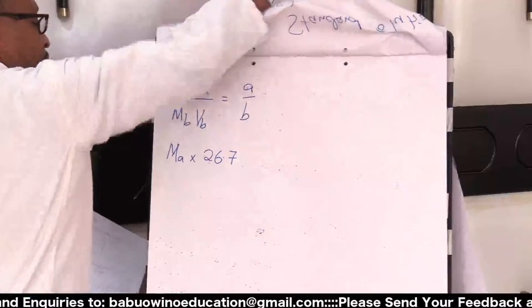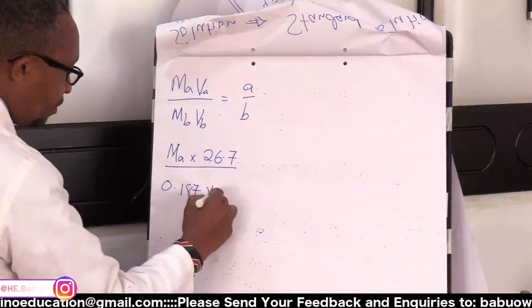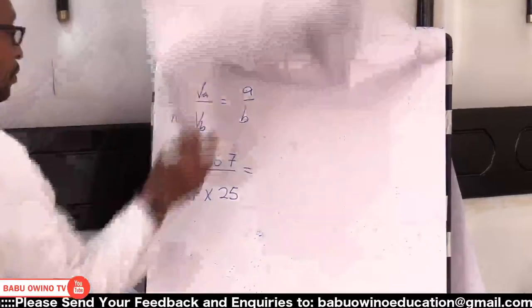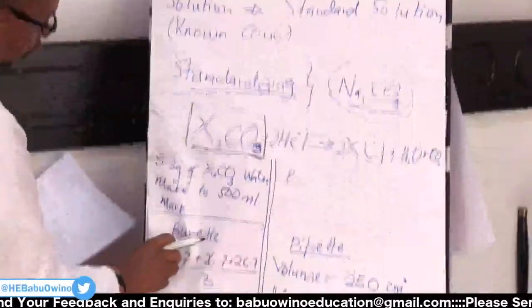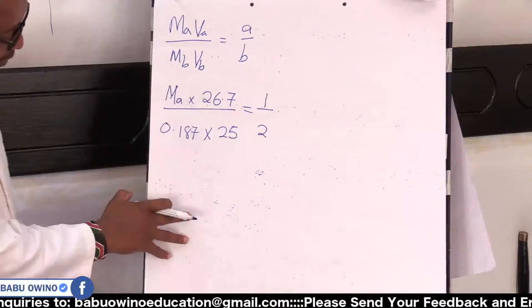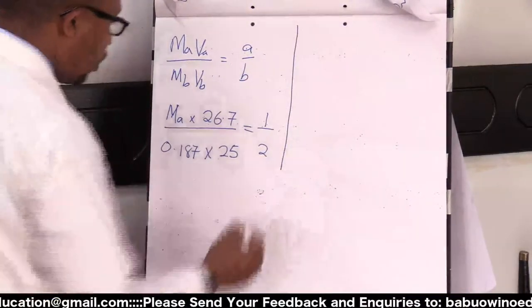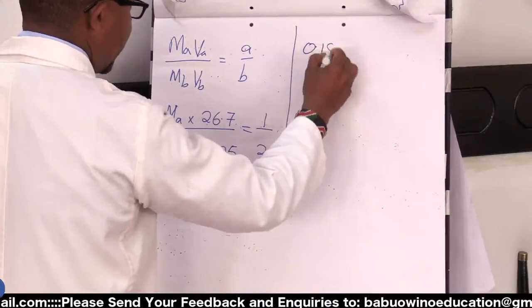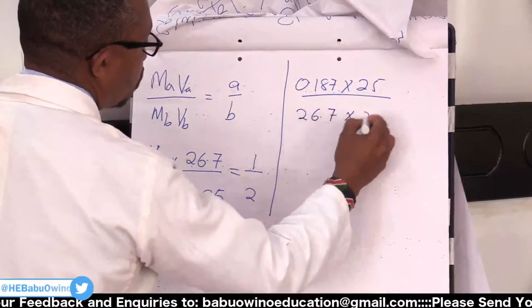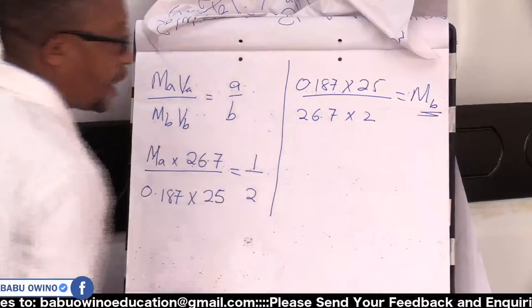26.7. So you divide this by 0.187 times the volume here, which was 25. The first one was this carbonate, so the mole ratio is 1 over 2. Again, class, it is very simple for you to work that out. It's a matter of cross multiplication, and you are home and dry. This is 0.187 times 25 divided by 26.7 times 2, and you get the molarity of whatever you didn't have, which was the base. That is the next question.